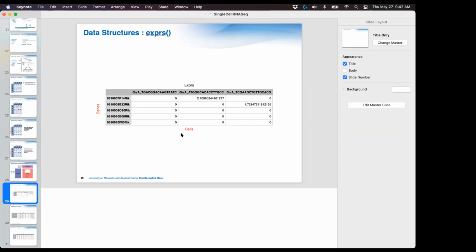But these technologies are very good to differentiate cell types, or to work on the differences between disease versus healthy cells, where those genes might be highly expressed in the disease, or highly expressed in the healthy cells but not in disease cells. So usually those abundant genes give you the story, but not that deep. I just want you to be aware of the limitations.